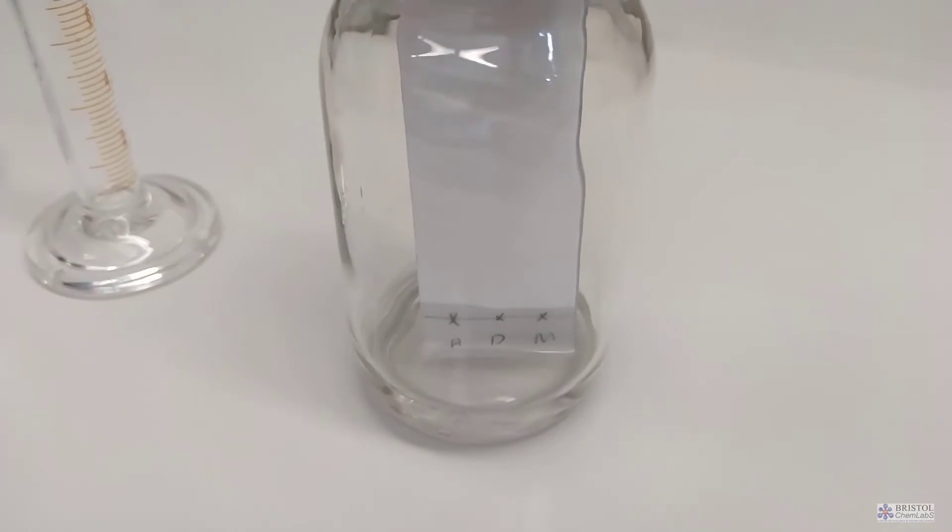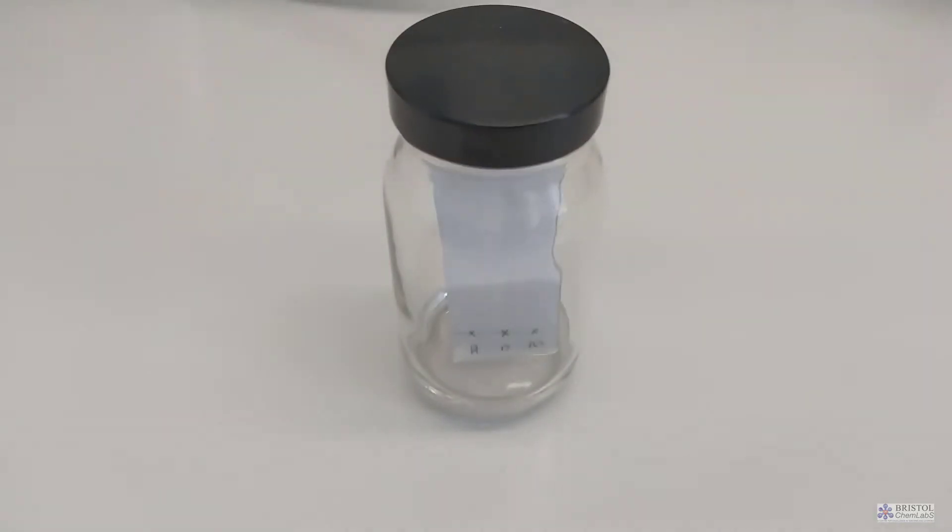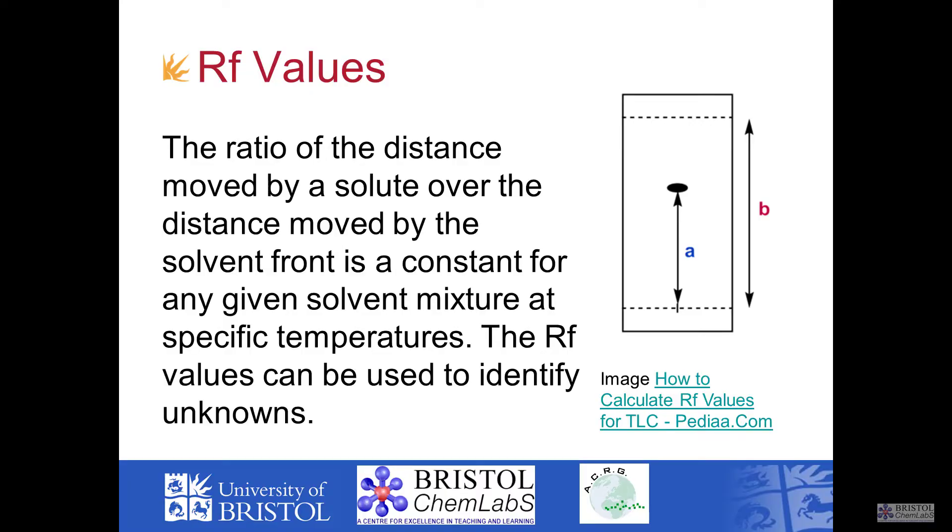As soon as the solvent front gets near to the top of the plate we unscrew the jar, take out our sample and immediately mark the position of the solvent front. If you wait more than a few seconds it will start evaporating and you won't know exactly where the solvent has got to. We would need to know where the solvent has got to if we were making calculations of RF values.